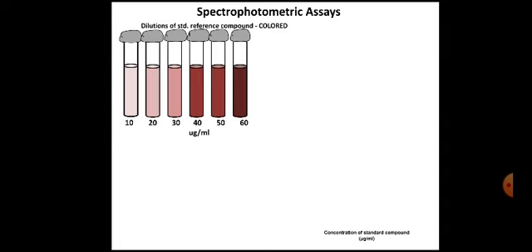These are the 6 dilutions I have mentioned just as an example. We can see the color differences here. The last tube, having a high concentration of riboflavin, is a little dark, whereas the first tube, having a low concentration, has quite a faded color. So you will find this color differentiation.